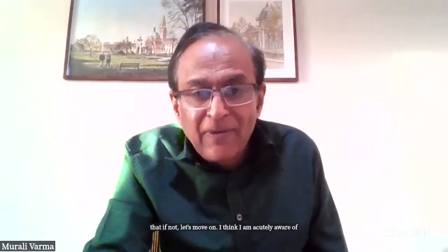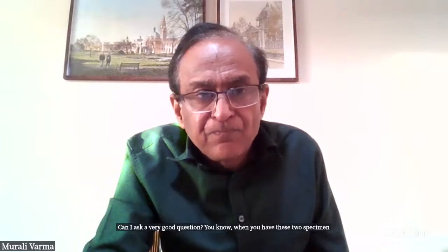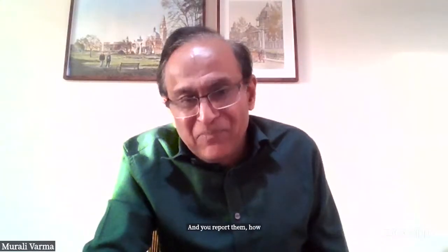Yeah, can I ask a question? When you have this TURP specimen and you sample some of it and you find incidental prostate cancer, and you report them, how often would you go back and put the whole thing through?